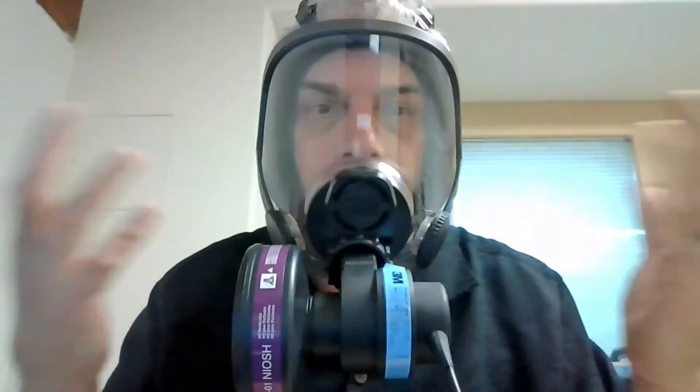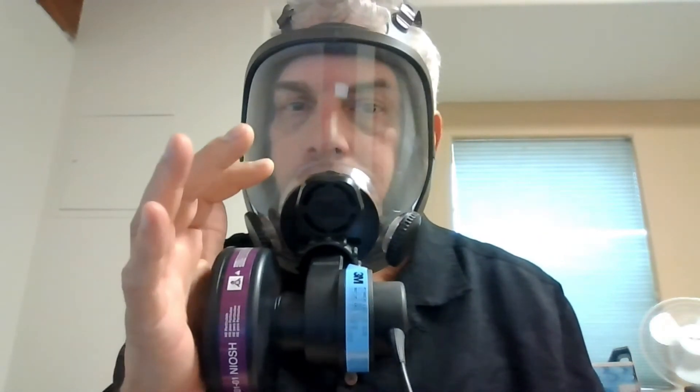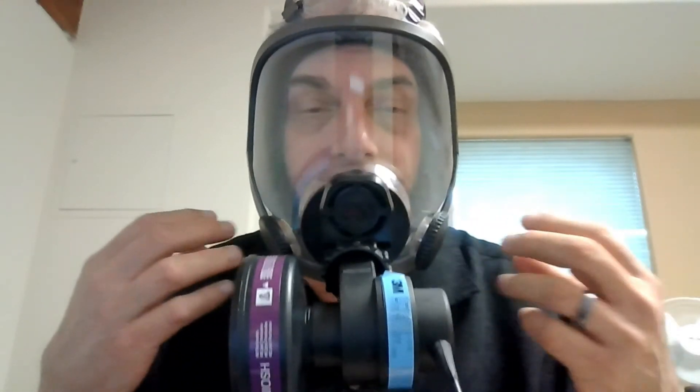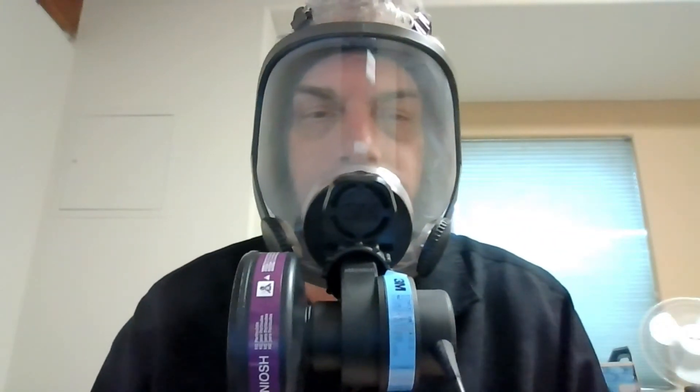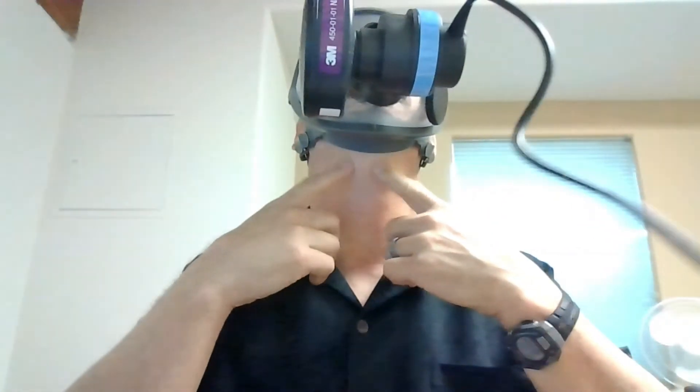No matter what configuration the mask is in, we cover the exhalation valve with tape to do the exhalation fit test. We also want to conduct a negative pressure test: cover the inhalation valve and breathe in — you'll see the respirator pulls down on my face, showing a tight negative pressure seal. With a PAPR, air will be blowing into the respirator 100% of the time provided the battery and motor continue to work. Check to make sure you don't have air leaking out the sides, blowing on your ear, blowing your hair up, or blowing on your throat.